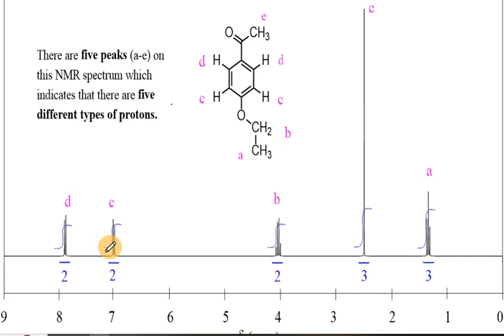That is what we call the integration number. So the integration number is the number of nuclei, or the protons in this case, that contribute to a particular signal in an NMR spectrum. Now let's see how we can correspond the protons here to the given signal here. If I've been given a compound and they ask you how many signals that compound can display in an NMR spectrum, it is equivalent to how many chemical environments are present in that compound.